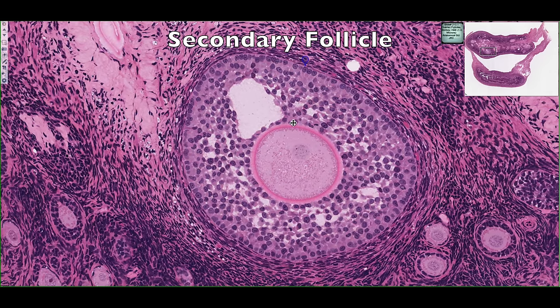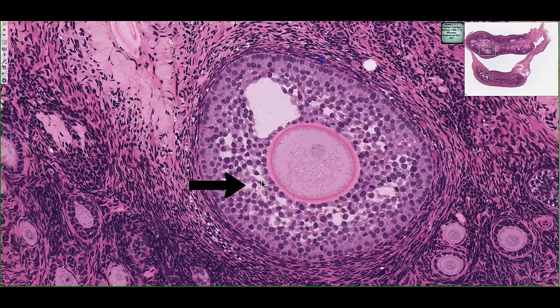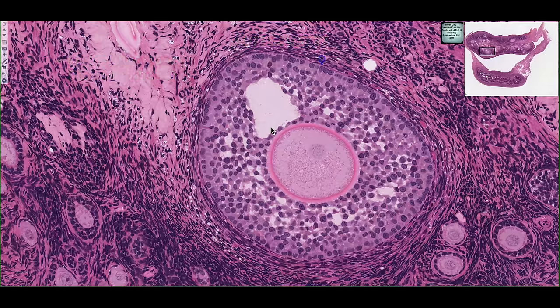This is a secondary follicle. Right away we can notice that it has multiple layers of granulosal cells. Amongst the granulosal cells, we see these white spaces — fluid that's starting to build up. In some cases, all these pockets of fluid coalesce into one single chamber called an antrum. The antrum is filled with a fluid called liquor folliculi, which contains many hormones such as progesterone, estradiol, inhibin, folliculostatin, and activin.